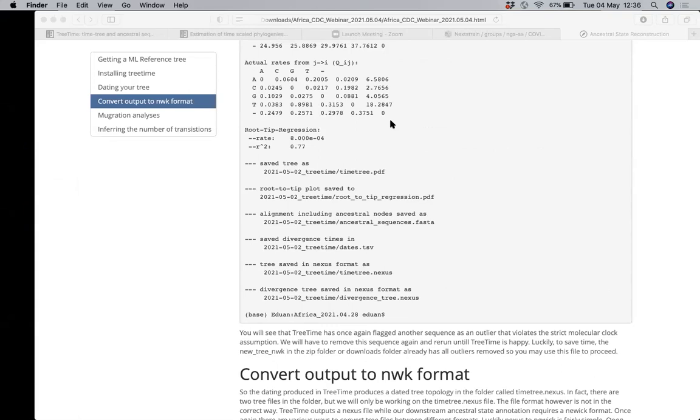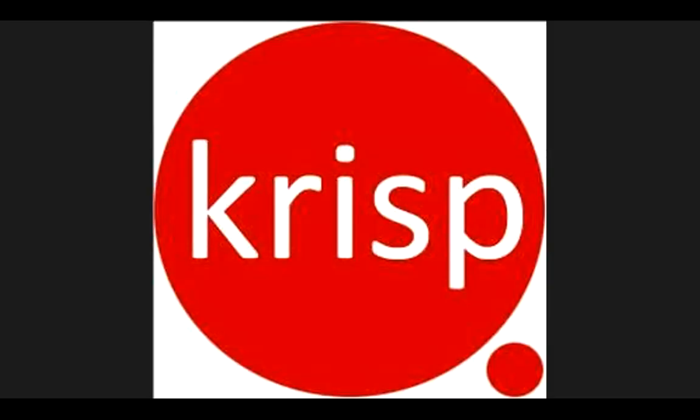So this is a new download. I did a new download of all the African data last week, and I think we've now got about 11,500 good quality African sequences. And I reran the analysis over the weekend, and so we'll update figure 1 and figure 2 in the manuscript based on these new results. I can show the script quickly if you want. Okay, I'll stop sharing.